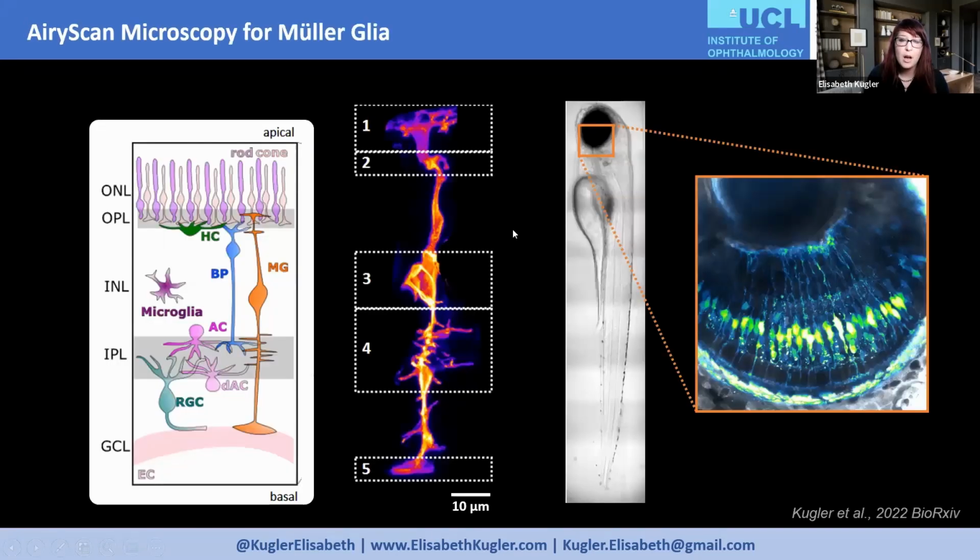So what we're working on are retinal glia cells called Müller glia cells, and these are a form of support cells in the retina which have a very specific shape, as you can see here, that allows them to interact with different cells in the retina, such as the photoreceptors, the neurons, or for example blood vessels. Their shape allows us to understand how they interact with other cells, but also how mature they are, and also in disease.